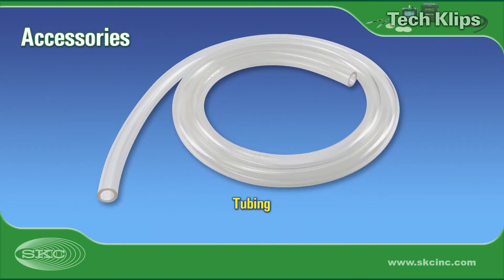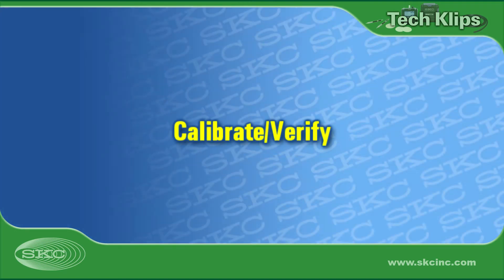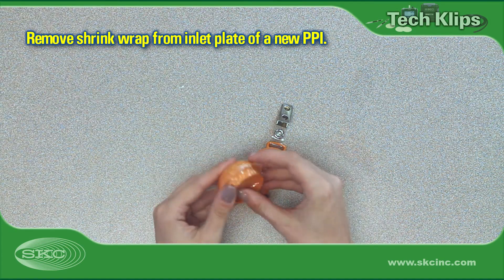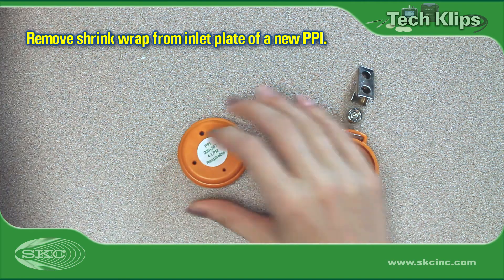Flexible Tygon tubing connects calibration and sampling train components. Calibrate and verify pump flow rate before and after each sample. For this video, we will use the SKC 4 liter a minute user-loaded disposable PPI. This PPI model is supplied with a shrink-wrapped inlet plate.